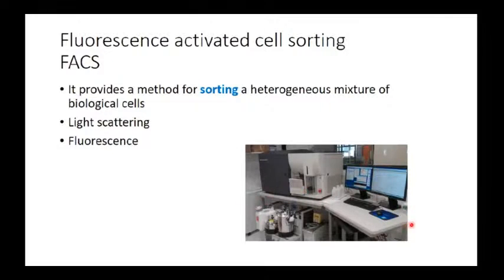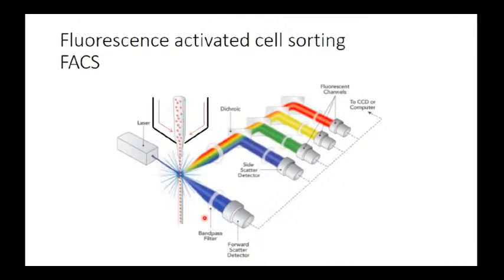So we have the machine, we have of course the computer, which is going to analyze the data, we have the fluids container and the waste container. Now, how does it work? A FACS machine looks like this from inside. So we have also the flow cell and the sheath fluids, which apply the hydrodynamic forces on the cells to pass them one by one through the tube. This is what we saw in flow cytometer in the previous video.